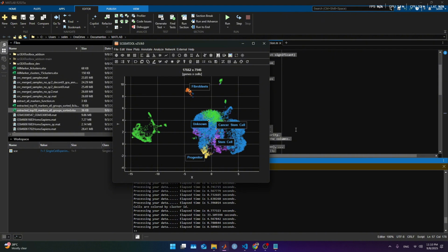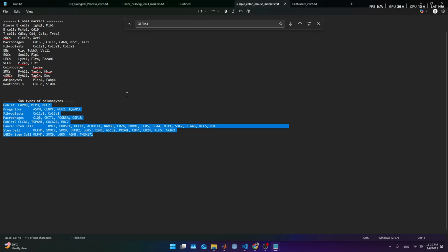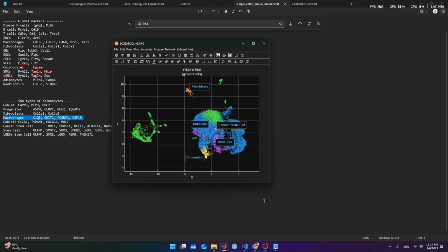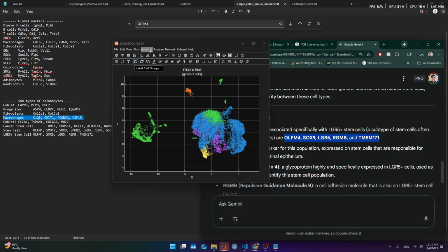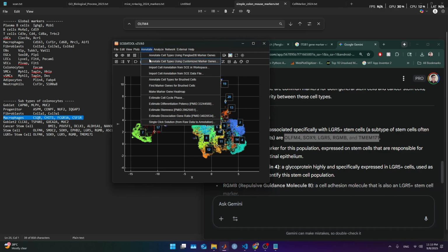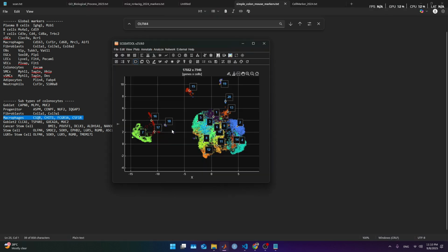I'm gonna try to make it easier because I think too many markers is confounding the algorithm. So I'm gonna try to just take all these other, and I'm gonna try to find out what else is there in macrophages, if there is anything. So we're gonna go back again, cluster ID, and then annotate with customize, no, paste the markers, and yes, automatically.